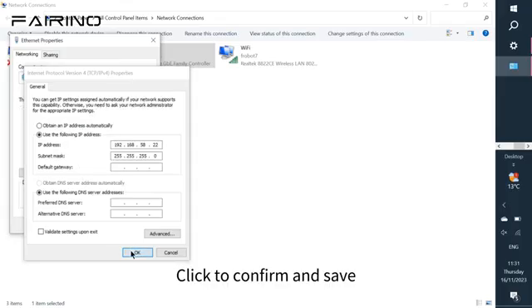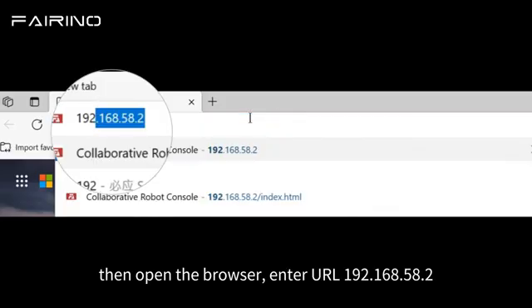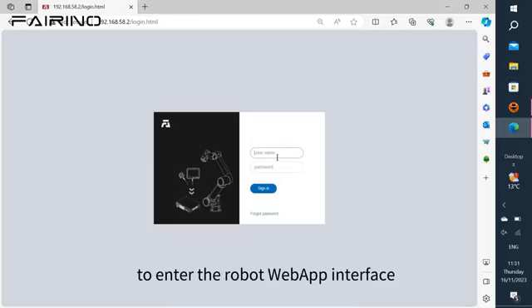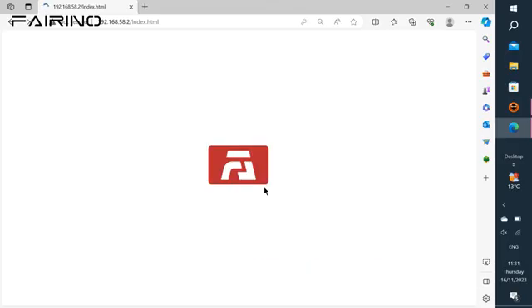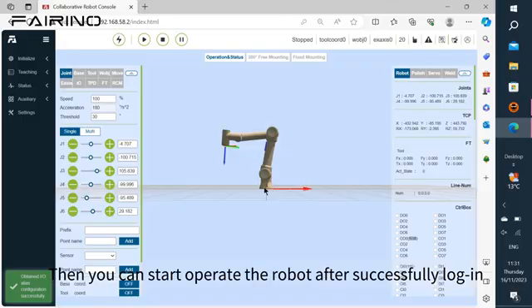Click to confirm and save. Then open the browser, enter URL 192.168.58.2 to enter the robot web app interface. Login account name: admin, password: 123. Then you can start to operate the robot after successfully logging in.